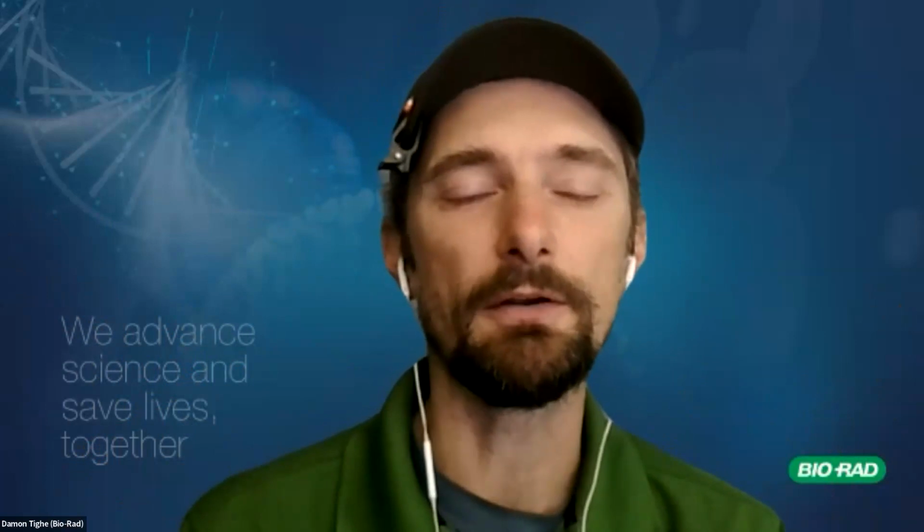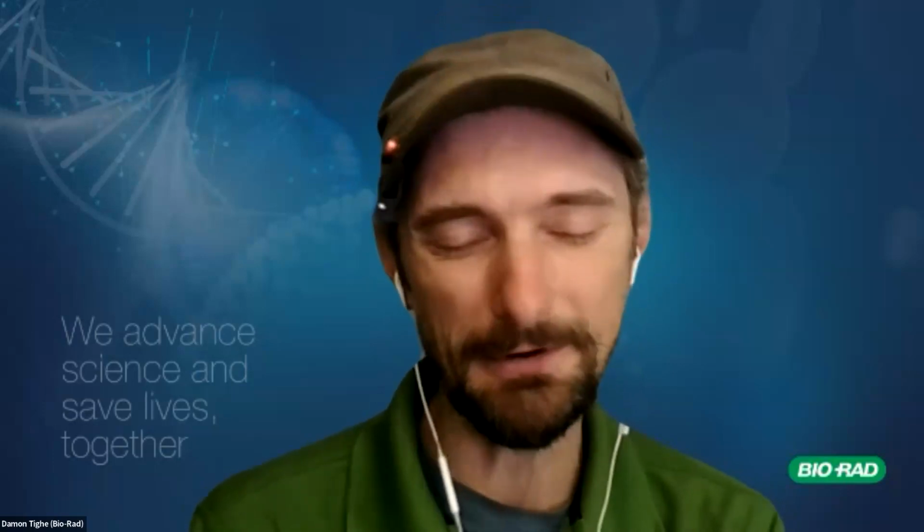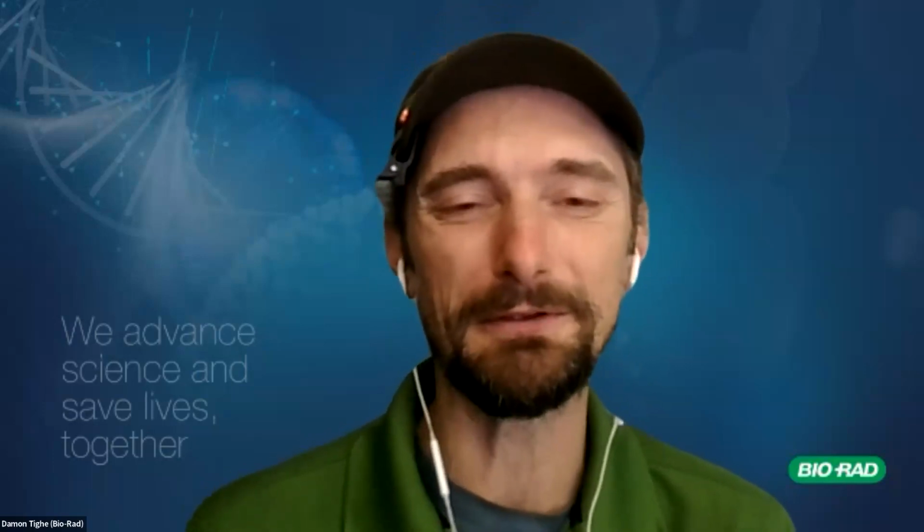Because if you've got that down, it's really easy for them to jump to the theory around real-time PCR, quantitative PCR, and droplet digital. I see a lot of classrooms do this through animation if they don't have access to instrumentation. If they've got access to instrumentation, using some of the available kits to make it easier on you as the instructor is huge, because with PCR there are a lot of movable components and you don't want to spend all of your time quality controlling them if something goes wrong. So it's really nice to work with something off the shelf.